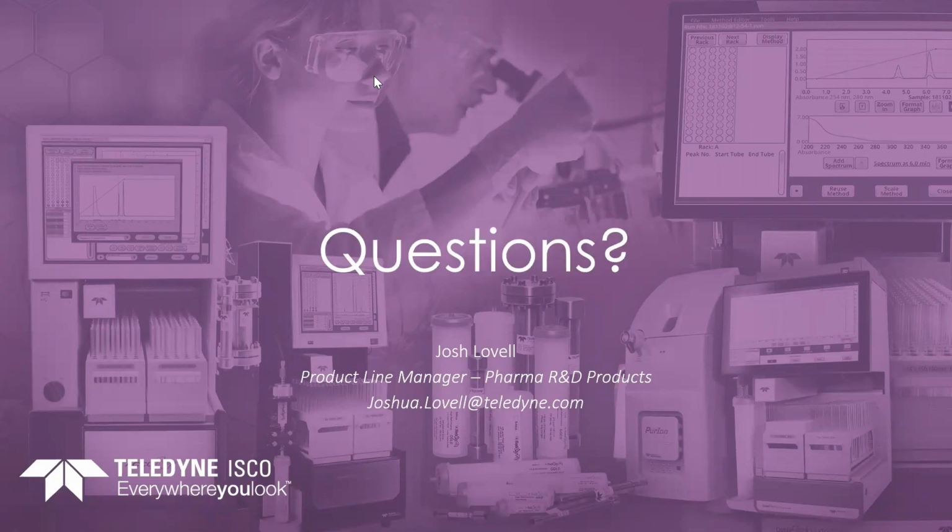Otherwise, you have to go sequentially through miscible solvents, like hexane to ethyl acetate to methanol to water. It's a little bit more complicated. So IPA is a great solvent to use. Just make sure that you flush all the flow paths and both sides of the pump, the A and the B pump, depending on what you're using.